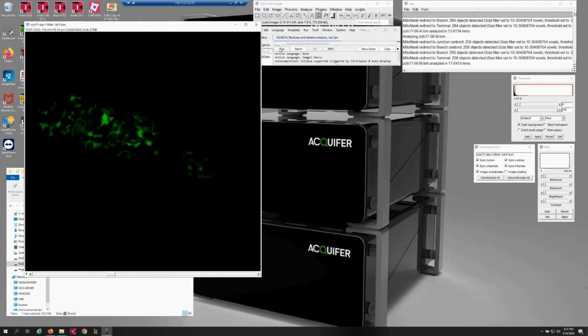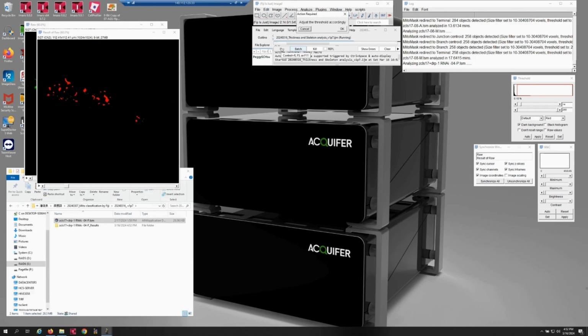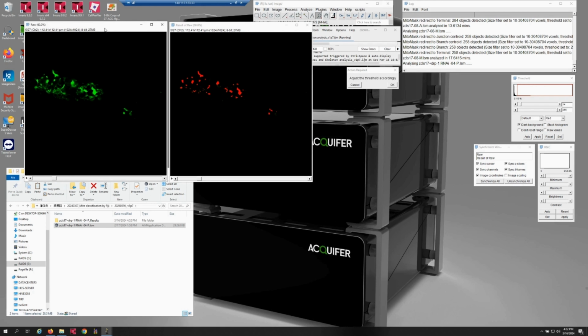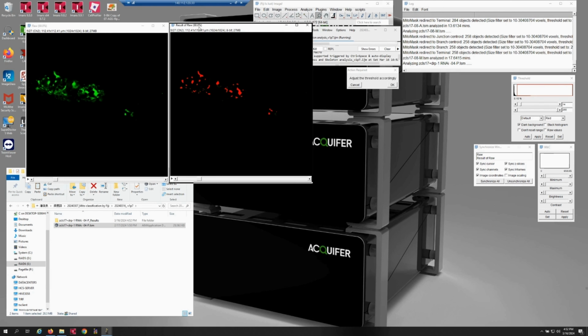Alright, next all you need to do is click Run. At this step you'll see a pop-up window appear. Now, regarding this step, I originally hoped that all the images could be processed with the same parameters, but I found that different C. elegans and their mitochondria image intensities are really not the same. So, this step is left to you, so you can define, based on the different images, exactly which areas belong to the mitochondria, and which areas do not.